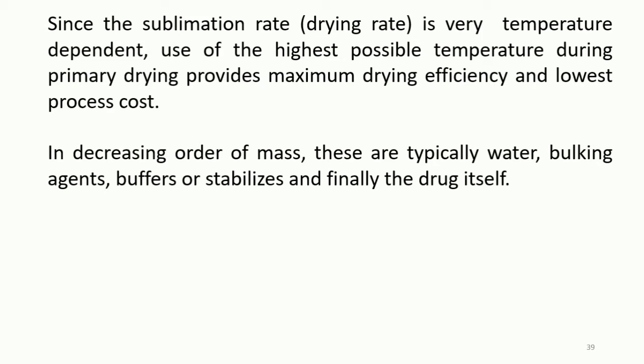The bulking agent, which can either be crystalline or amorphous in nature, and its interaction with frozen and unfrozen water in the frozen solution actually define the physical structure which is essential to successful freeze drying.